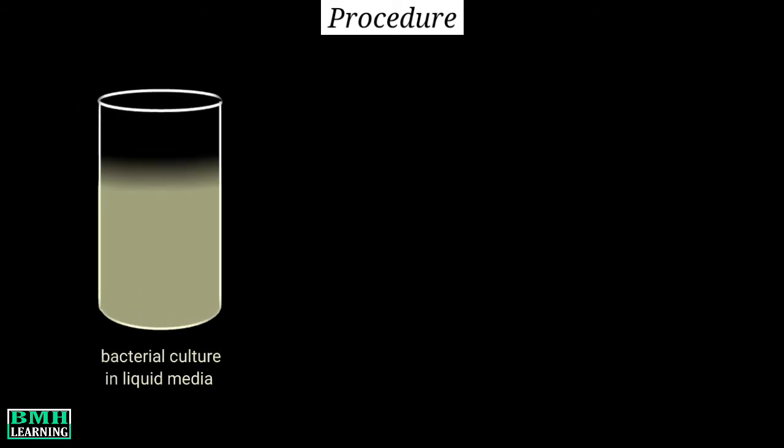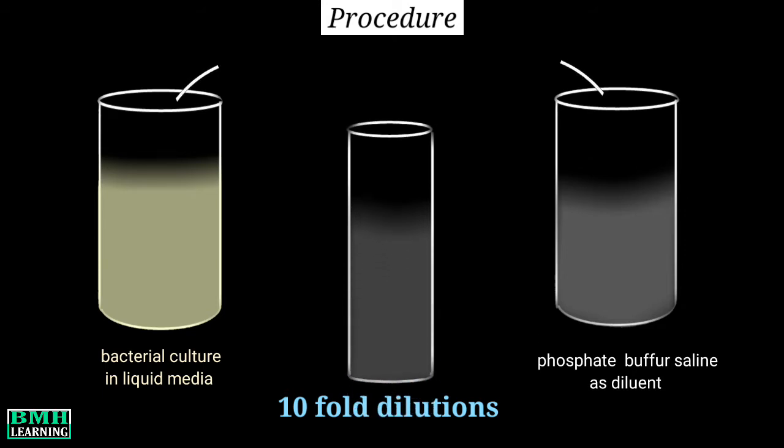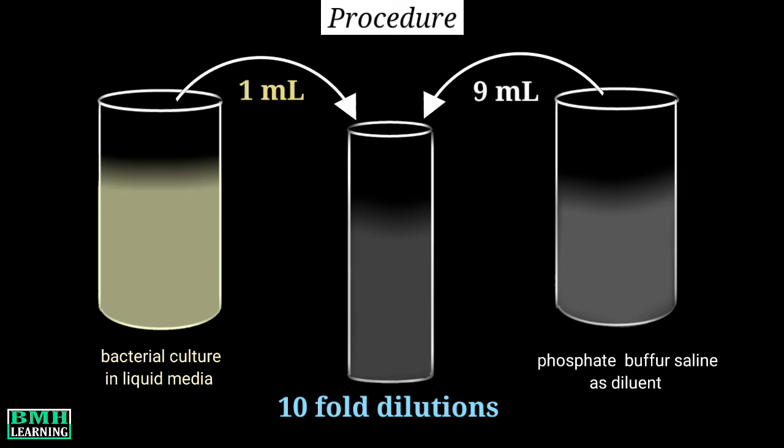Procedure. First thing we require is a bacterial culture, or inoculum, or suspension. The inoculum is in liquid media. We need to make 10-fold dilutions of the bacterial suspension. For that, we are using phosphate buffer saline as diluent. To prepare 10-fold dilutions, we take 1 ml of bacterial suspension and 9 ml of PBS.